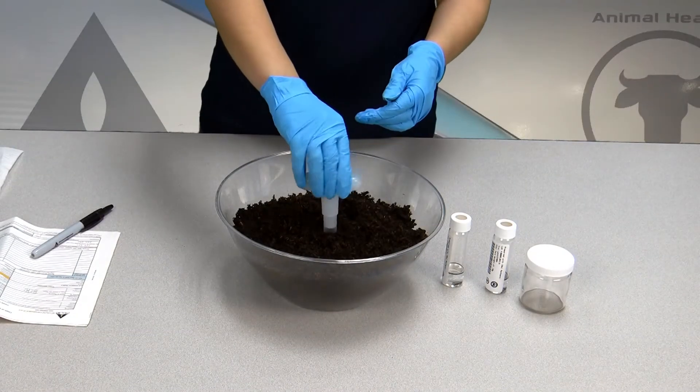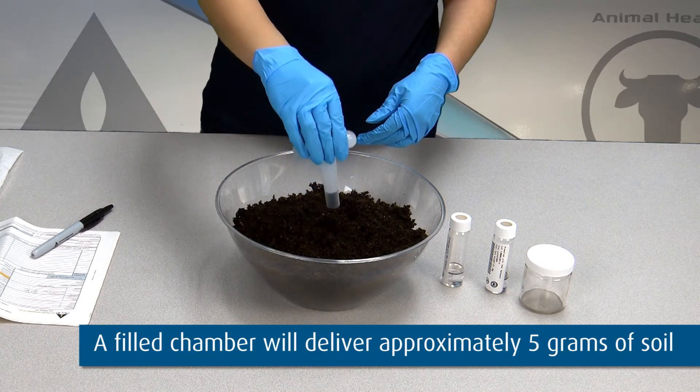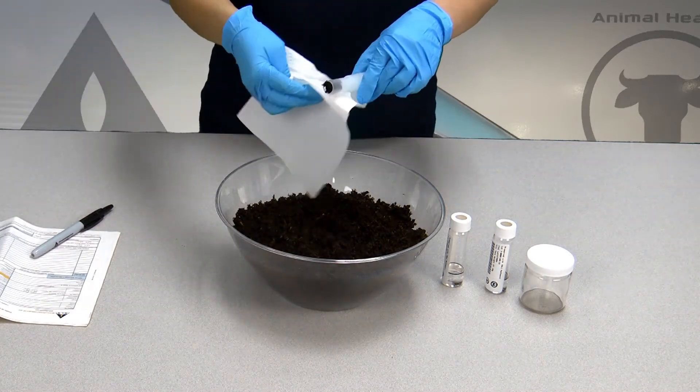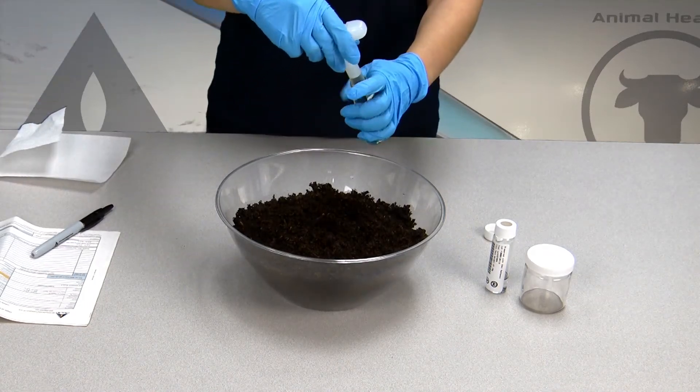With the plunger seated in the handle, push the TerraCore sampler into freshly exposed soil until the sample chamber is filled. Wipe all soil or debris from the outside of the TerraCore sampler. Place the mouth of the sampler into the 40 milliliter vial.